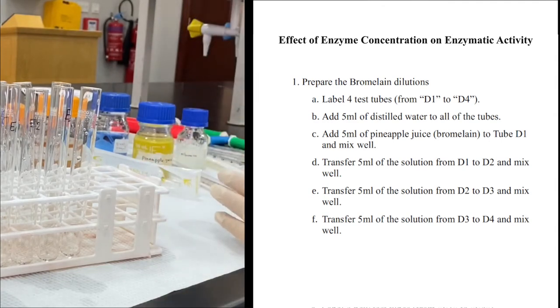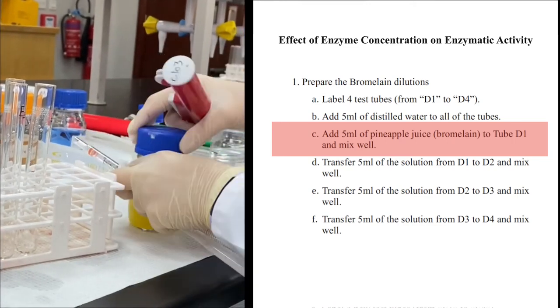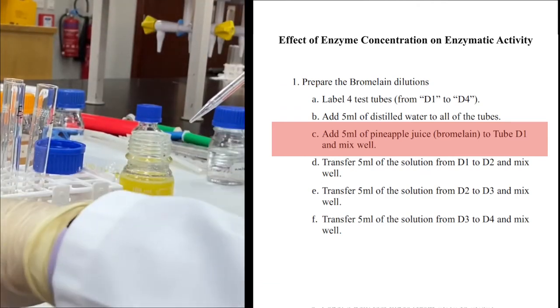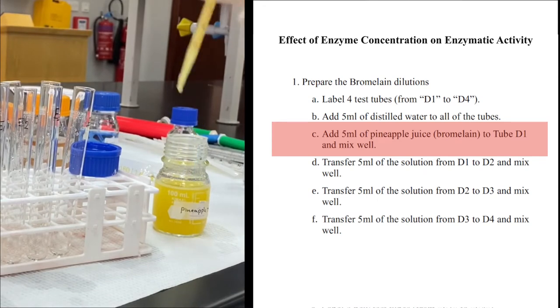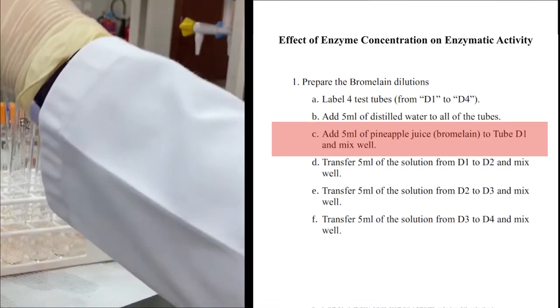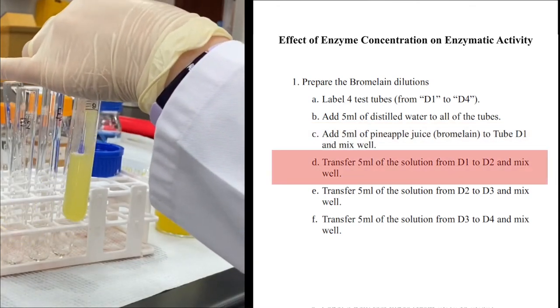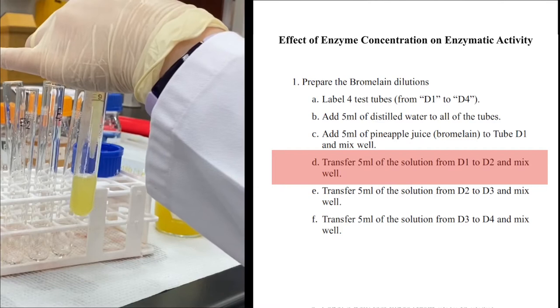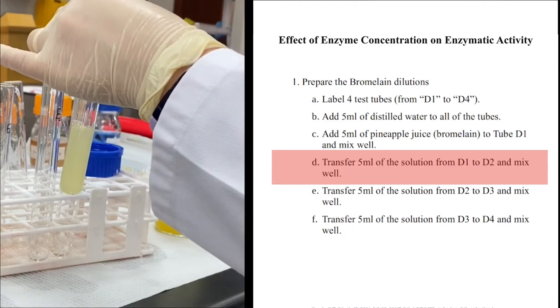Now I will execute the dilutions. Using a new 10 ml pipette with the pineapple juice, I add 5 ml to the first test tube — each tube already contains 5 ml of distilled water. I mix the components; this is the 1-to-2 dilution of the enzyme. Then I take 5 ml of this dilution and add it to the second test tube — 5 ml to 5 ml, giving another 1-to-2 dilution.